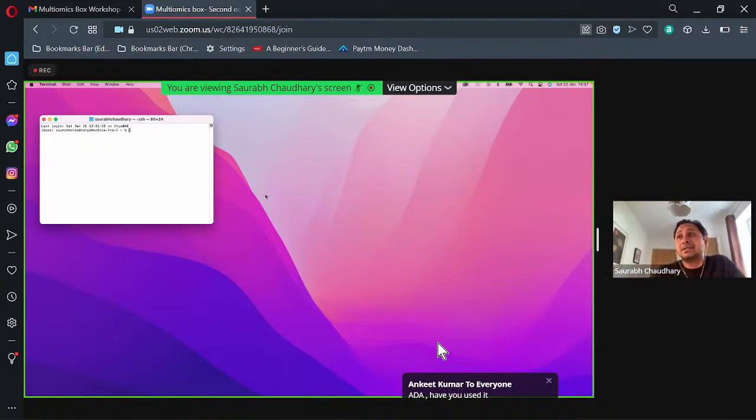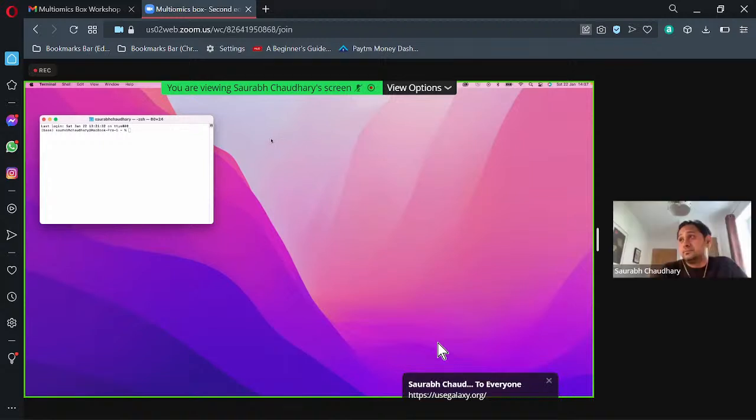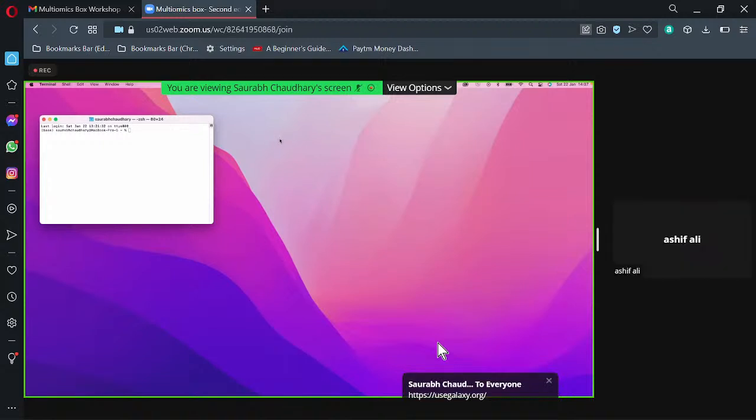With Galaxy, there are parameters which are fixed, which you can't change. But for this kind of analysis, it will work. I have used Galaxy many times. Using Galaxy, I have done the assembly using Trinity and Trimmomatic and other things. But sometimes many people say that the result generated by Galaxy does not give as many transcripts as when using Linux and using Trinity and other tools.